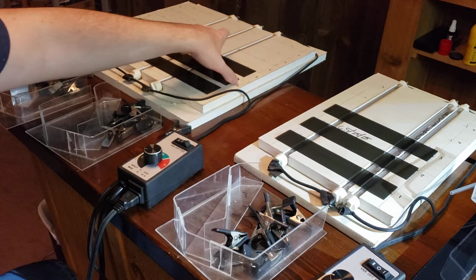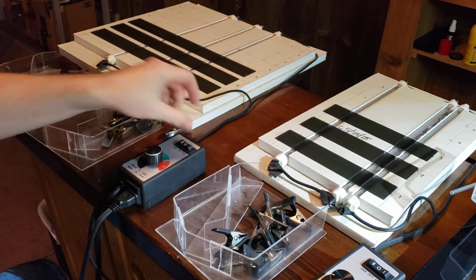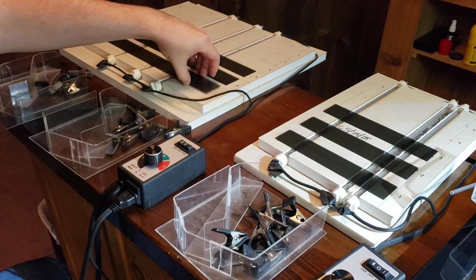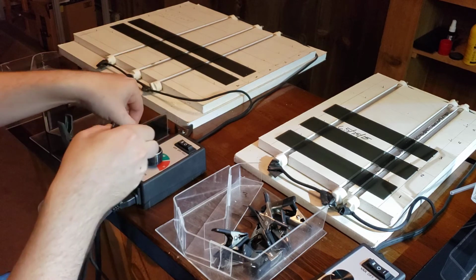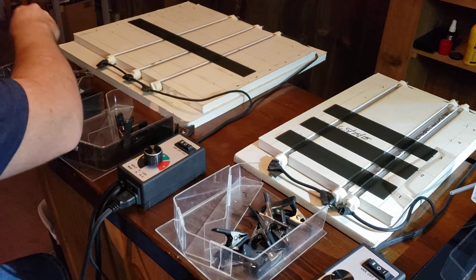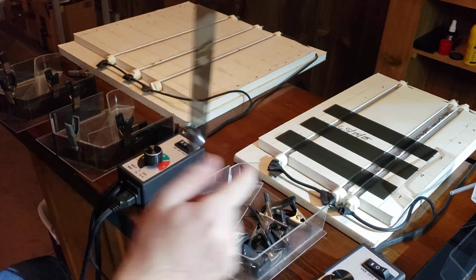So I'm just checking the heat, make sure it's softening up the joints. I clamp it onto the jig, let it cool off. Start that one.